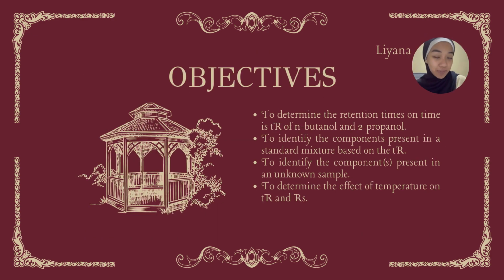This is the objective of the experiment. First is to determine the retention times of N-butanol and 2-propanol. Next is to identify the compounds present in a standard mixture based on the TR. And then to identify the components present in an unknown sample, and also to determine the effect of the temperature on this TR and RS.